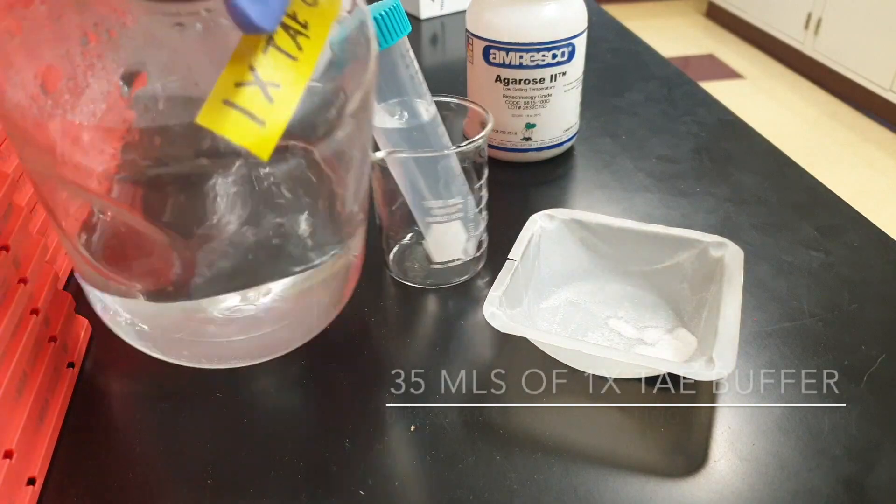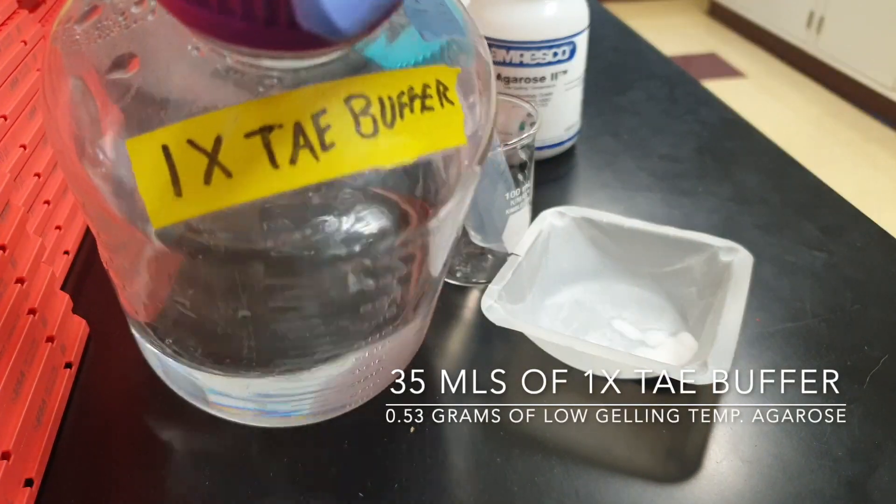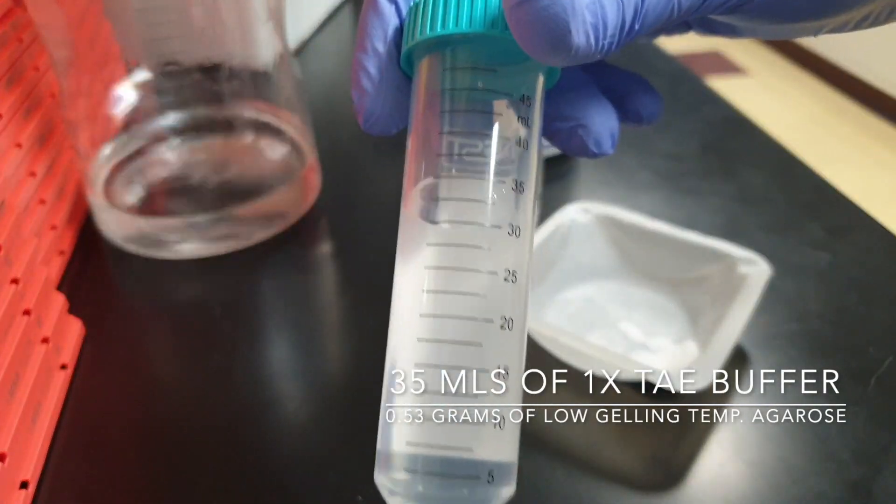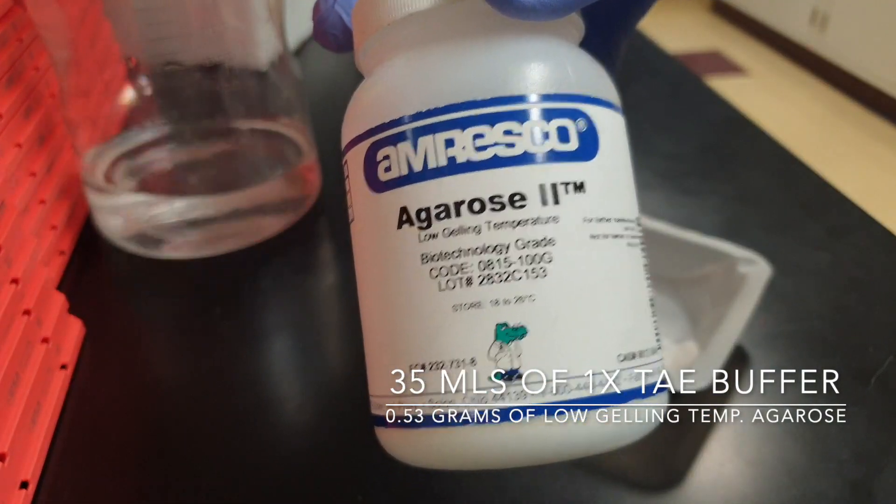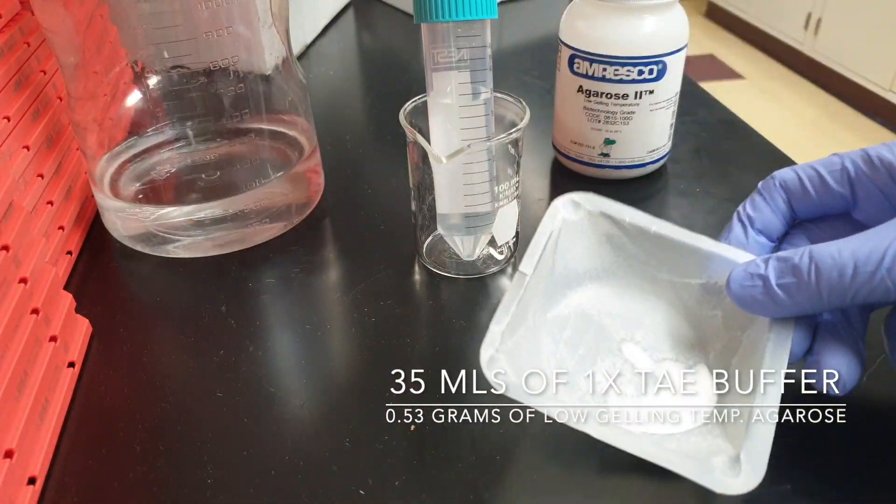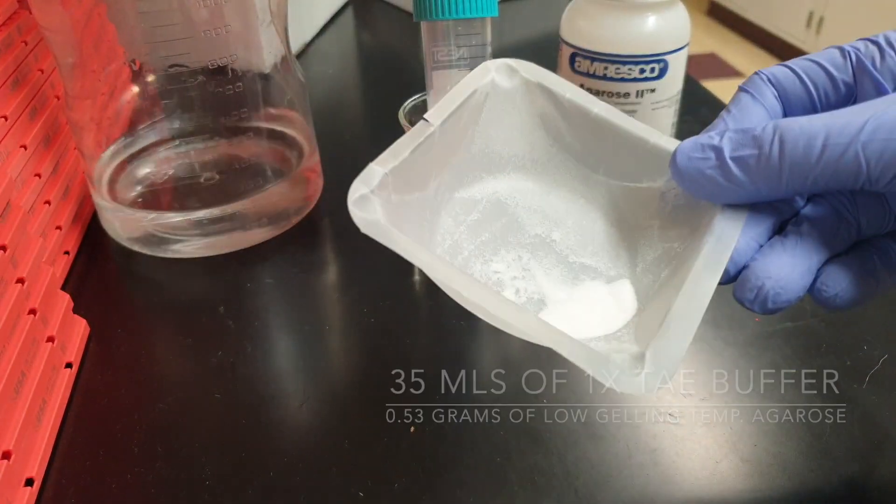So to start off with, I have one times TAE buffer, 35 ml of it and then I have my low gelling temperature agarose, 0.53 grams. So about half a gram.